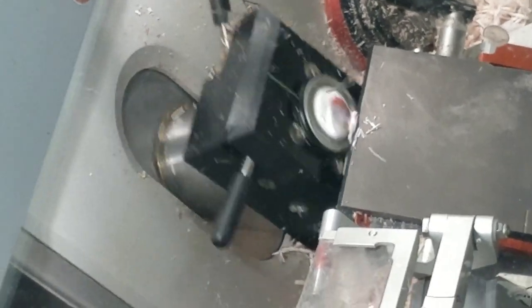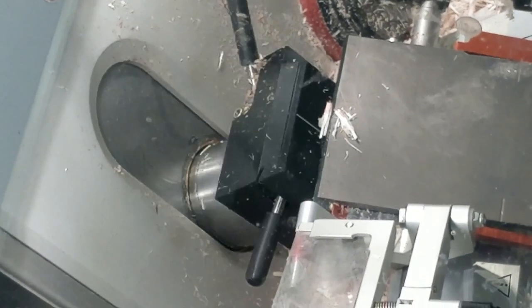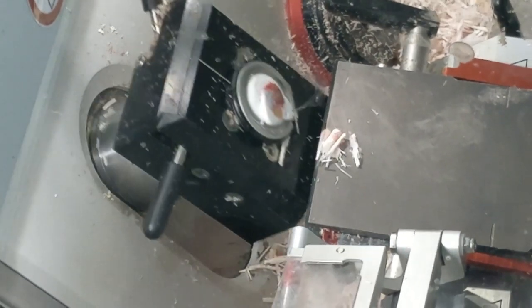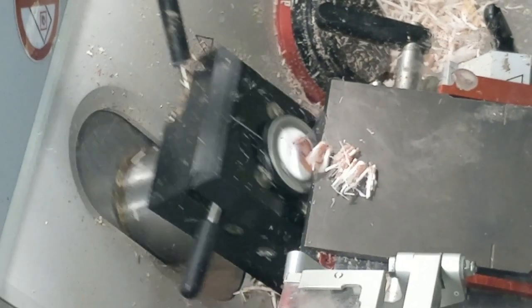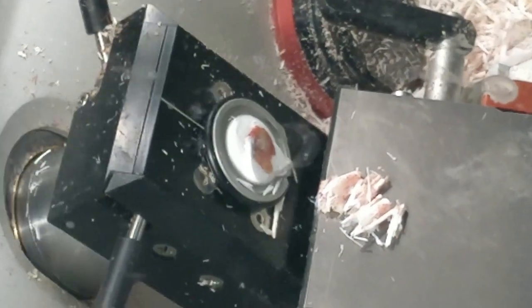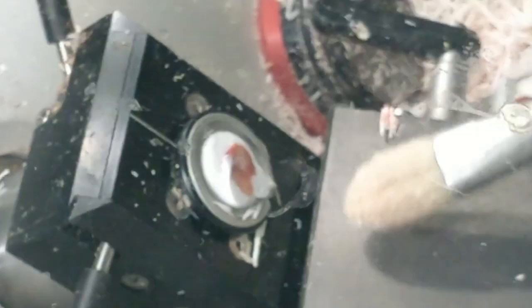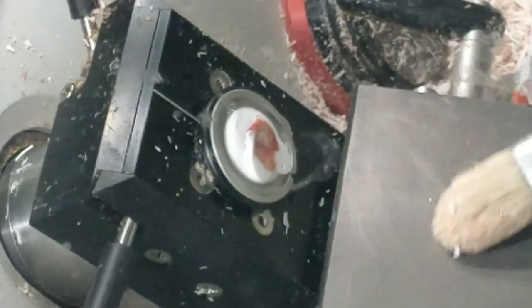Cut away the excess freezing media. No? So the freezing media acts as a structural support too, so that the tissues stay intact. So if you can see, the specimen tissue, the tissue rather, is now exposed.